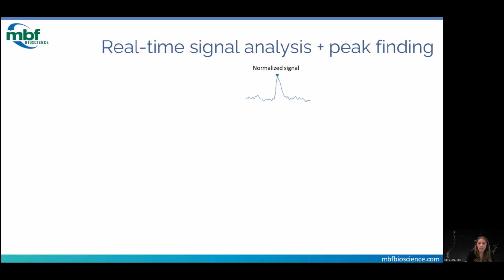So when you're doing peak finding post hoc, the steps are a little bit different because you know both when the peak goes up and when it comes down. However, if you're doing this in real time, you don't have time to wait for that peak to go down because it's going to introduce a significant delay between neural activity and hardware execution. And so we had to get a little bit creative to figure out a way to identify those peaks as soon as that peak starts to rise.